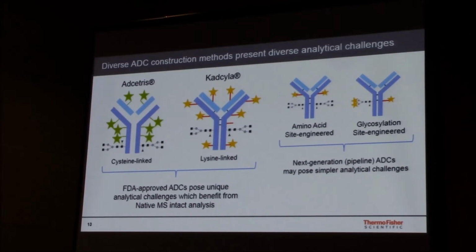Now in the future, and in development right now, are these next generation pipeline ADCs. So site-engineered ADCs, or glycosylation-specific. There are a lot of really clever tricks out there. They're not commercially available yet, but this is maybe going to be easier analytically. We don't know, I hope.